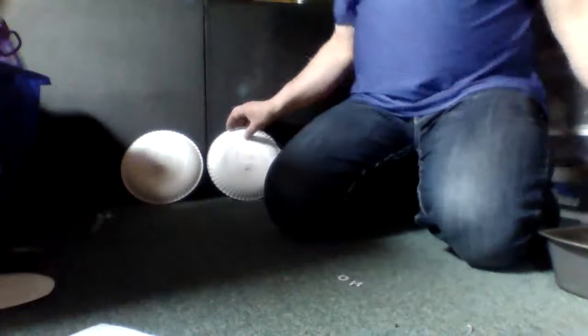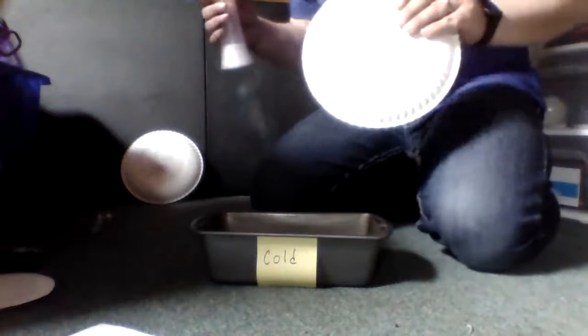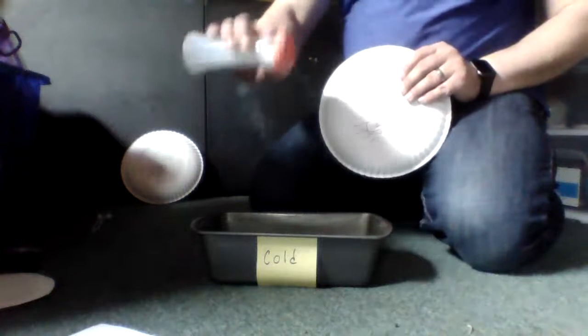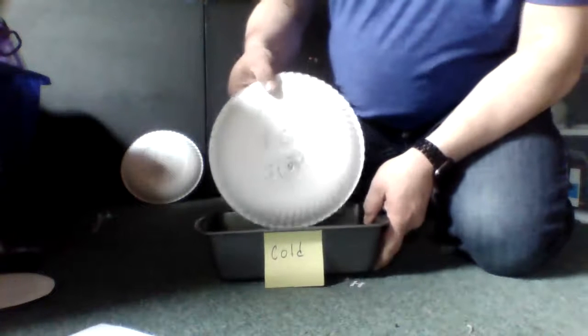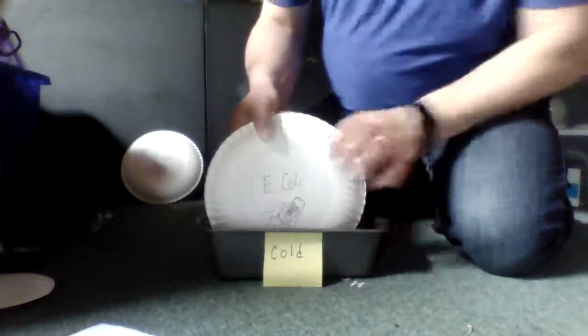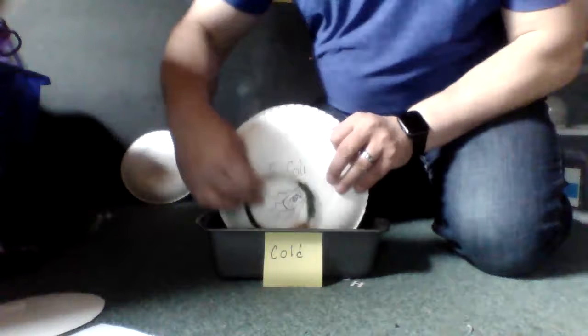Alright, so we're going to take this ice bath, or this cold bath, and we're going to add, it's supposed to be calcium chloride, but we're going to be adding sodium chloride, which is salt. To add that, we've got to add some kind of a salt to it. Then we take this and place the E. coli into the cold bath to make them competent. We take that and go ahead and add that plasmid to it.